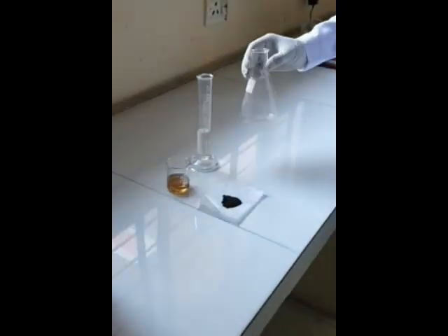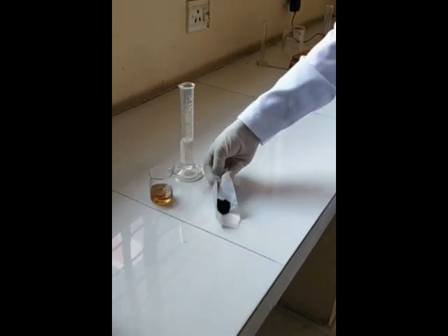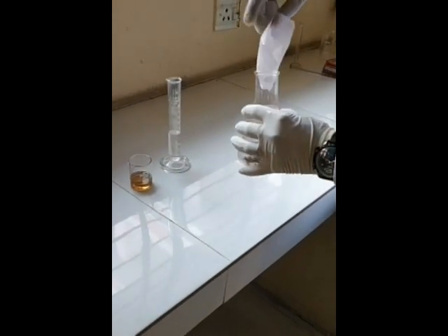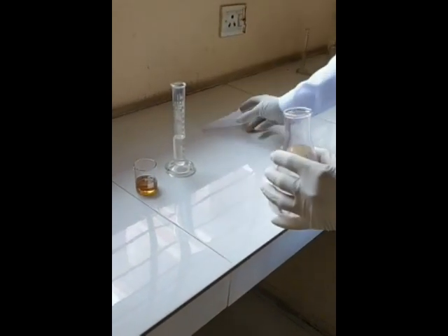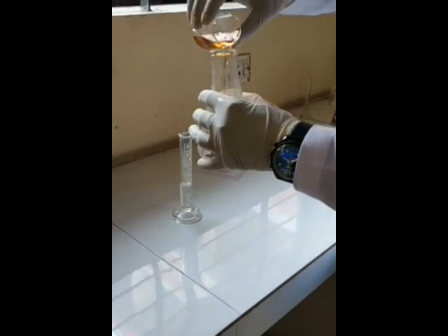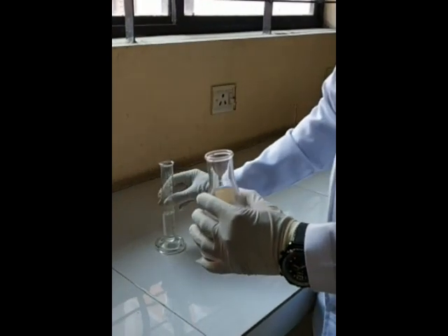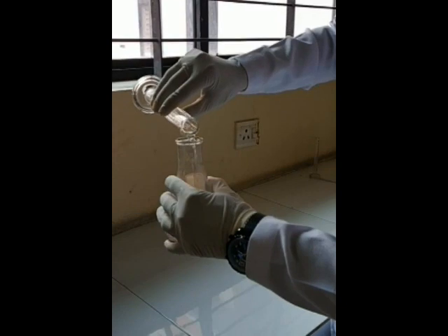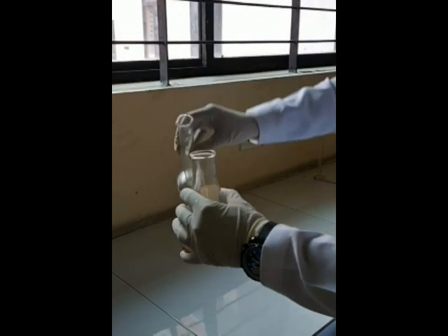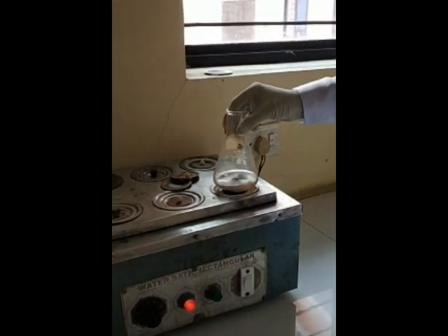Now we will start the procedure. In a 250 ml conical flask, take iron fillings. Add 20 ml of phosphoric acid and 25 ml of purified water. The mixture is then placed on a water bath until the iron dissolves.